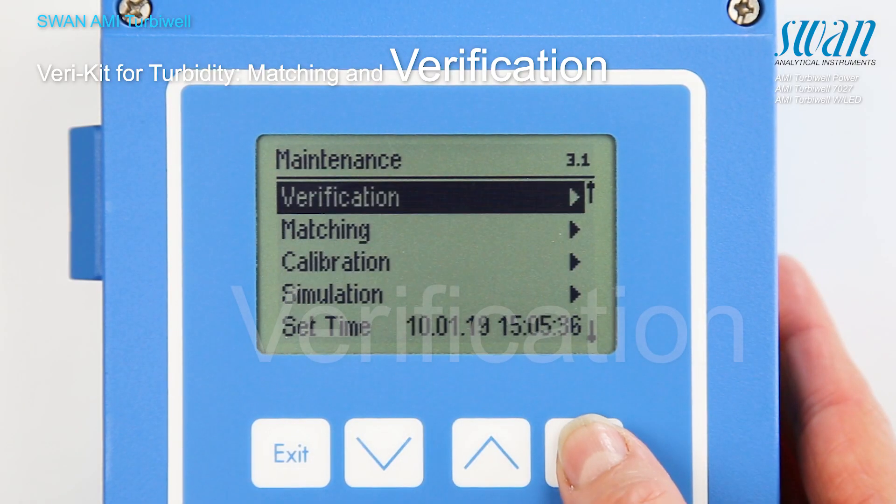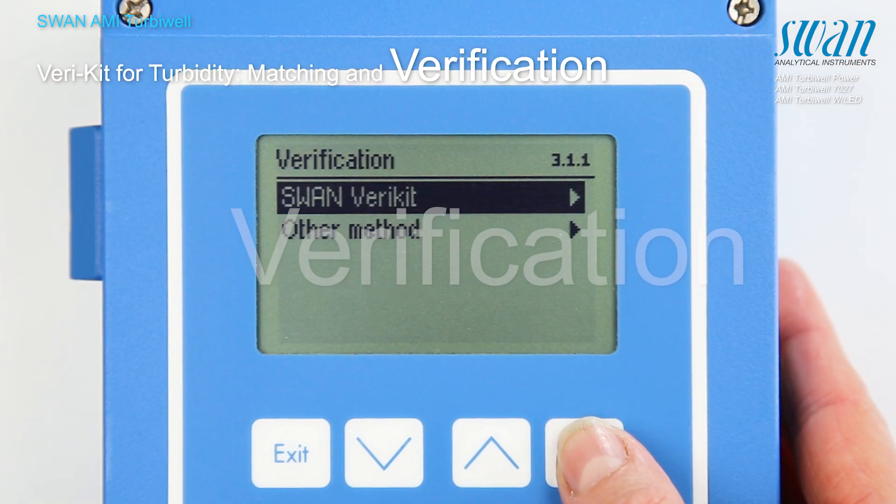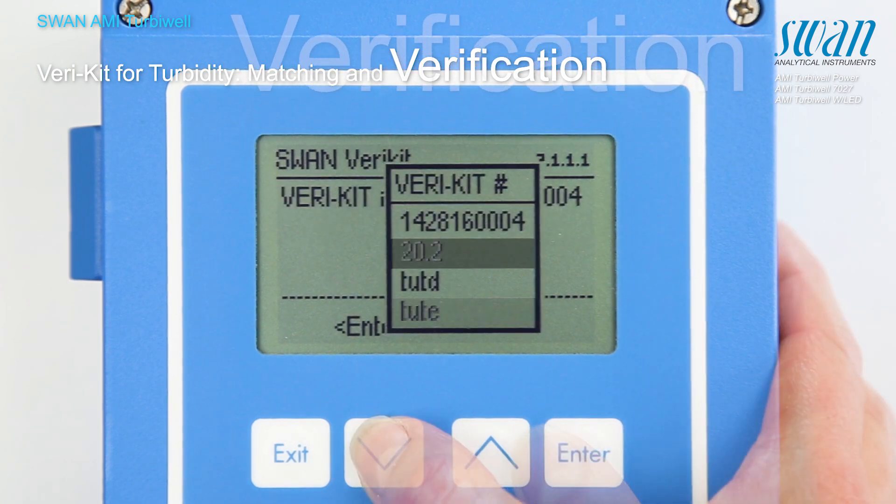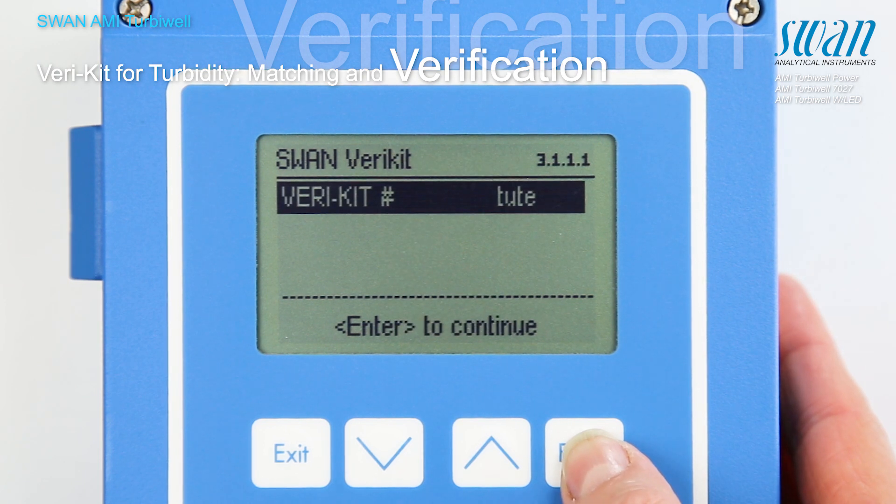The verification procedure is menu-guided. Choose the desired varikit from the list and proceed according to the instructions on the screen.